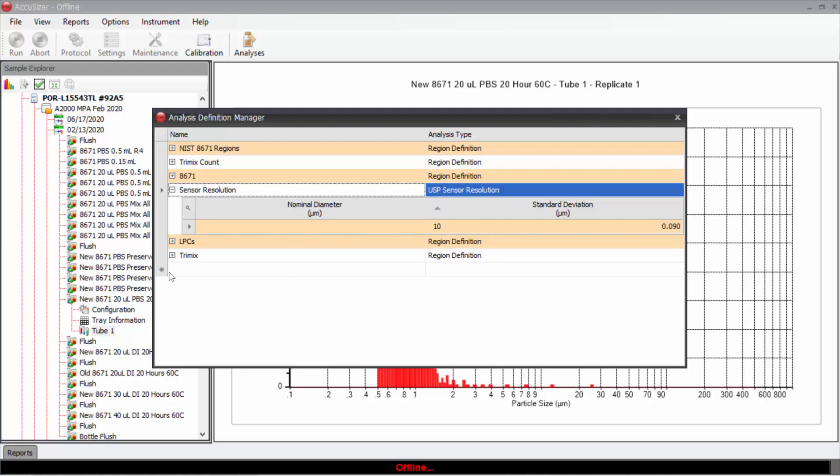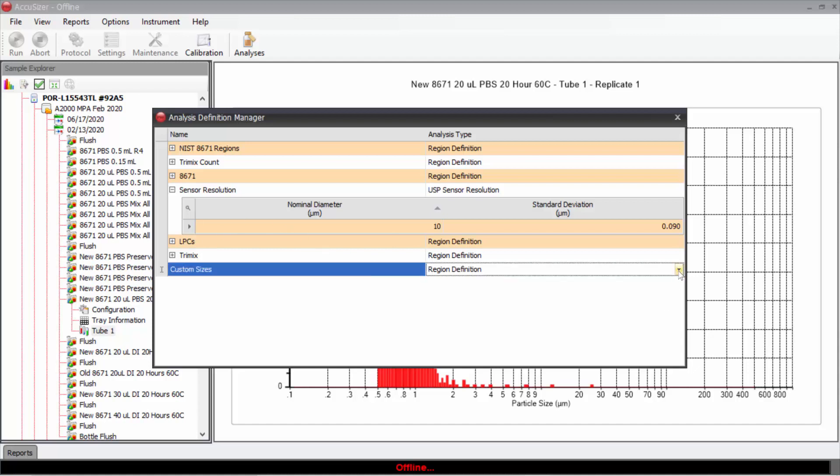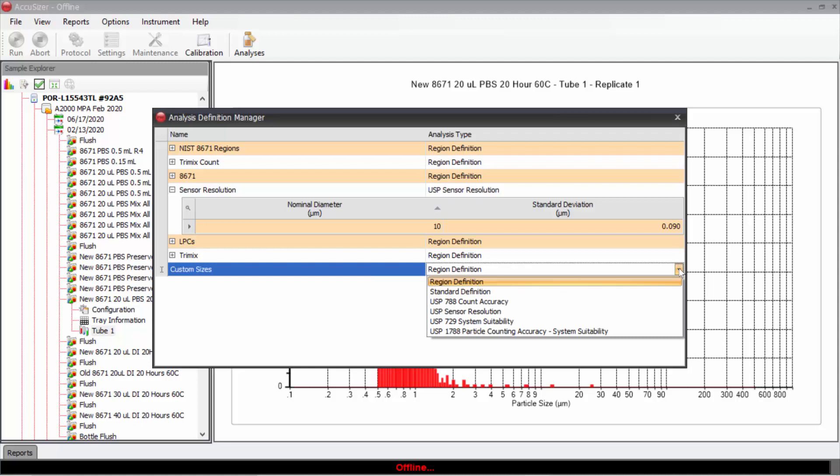Okay, so let's start by creating a new set of sizes for regions. I can come down here and click on the asterisk. I'm going to call something custom sizes, and over here under analysis type, I can choose what type of analysis region I'm trying to define.